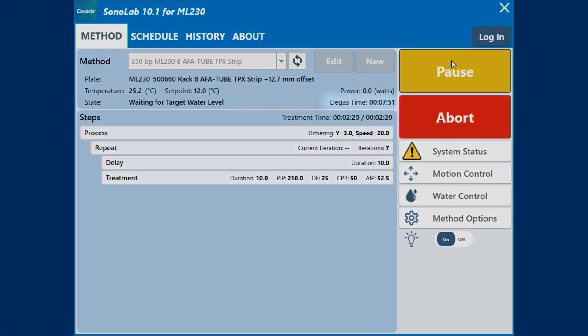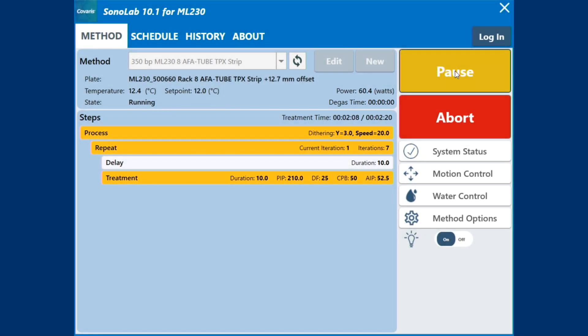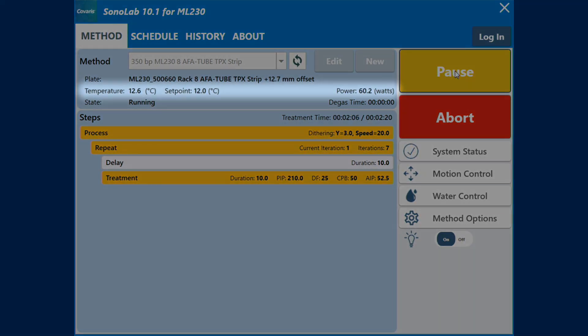There is a timer that counts the degas down. As the method runs, the process and treatment bars turn yellow and the actual average incident power and temperature data are displayed.